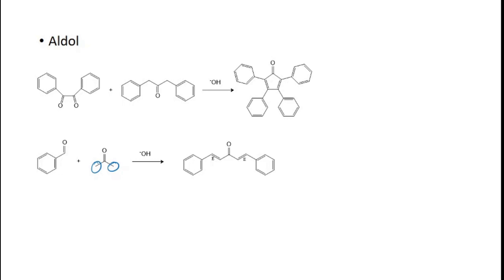And when we do form the alkenes, in this case, as with the Wittig, it is possible that we can get both E and Z isomers, or both cis and trans. So keep that in mind. Something to think about is how would you distinguish between the two, or determine, given a nuclear magnetic resonance spectrum, whether you have cis or trans products, or maybe cis and trans.